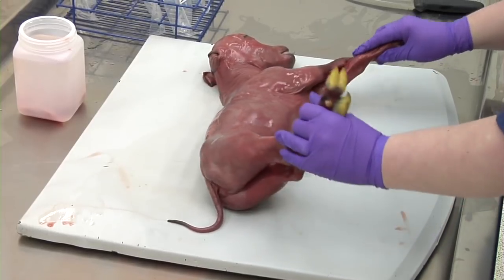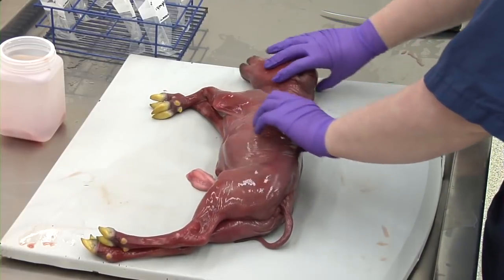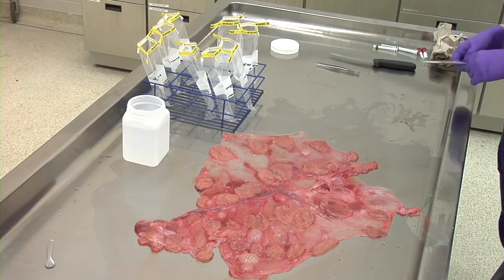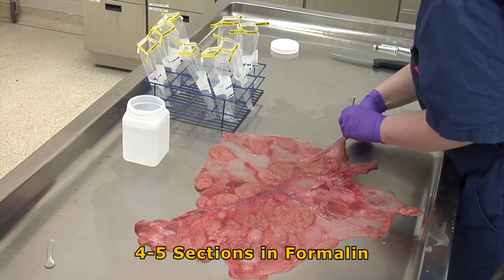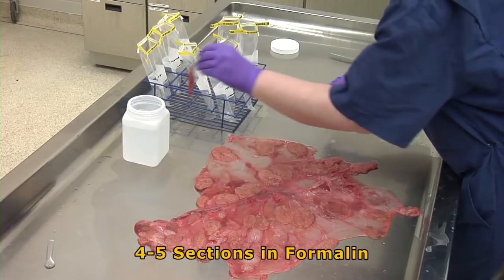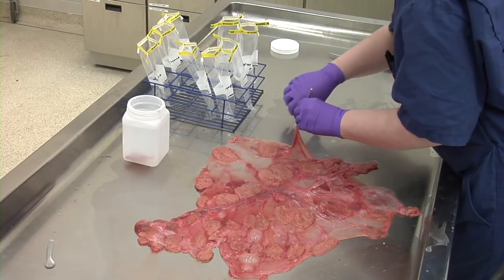Evaluate the external appearance of the fetus and placenta before sampling. Estimate the gestational age if possible and note any lesions. Look for evidence of cotyledonary necrosis or cupping and evaluate the thickness of the placenta by spreading it out in a single layer. The placental tissues can be gently rinsed with water if they are obscured by dirt, straw, or manure. Place four to five sections of placenta including cotyledons and the intercotyledonary tissue from several different areas in formalin. Placental lesions can be localized, so collecting samples from several areas is important.